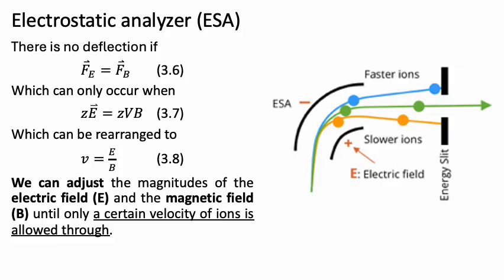Even if we are only measuring carbon and letting carbon through, as we saw in the graph before, there are some carbon ions that don't have the same velocity because they hit the wall of the mass spectrometer and were deflected in some way. Those aren't being let through.